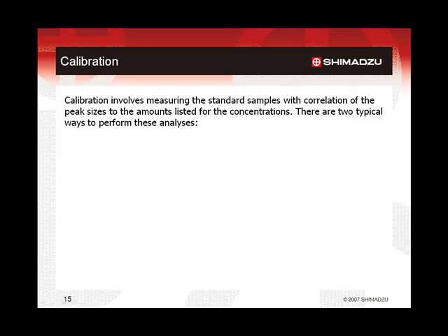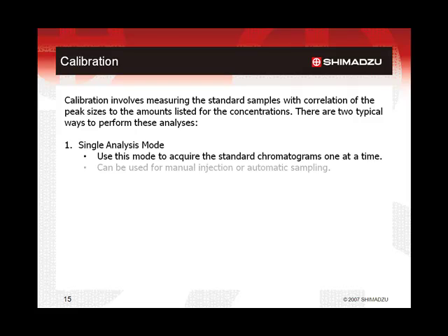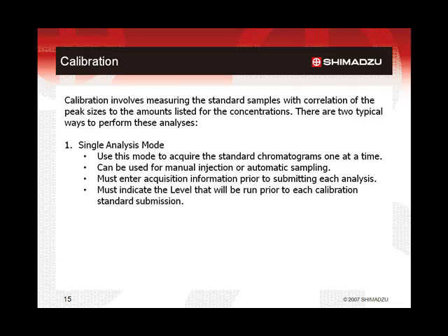Once the peak table has the necessary information entered, it is time to calibrate the method by correlating the amounts listed for the standards to the sizes of the peaks obtained via analysis. There are two common ways to accomplish this. The first is using the single analysis mode, which is intended for the analysis of one sample at a time. Therefore, it can be used with either manual injection or automatic sampling techniques. Because the analysis is performed one at a time, the acquisition information must be entered prior to submitting each sample. Because this is for a calibration standard, the intent to use it as a calibration standard and which level it represents should be selected before analysis.